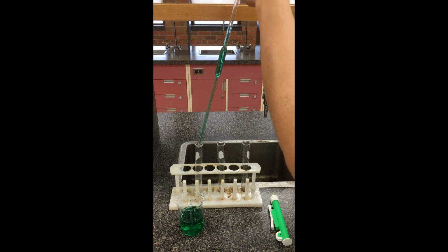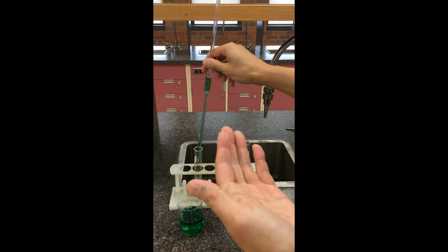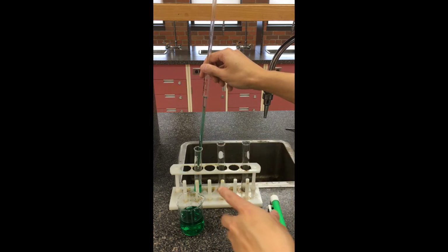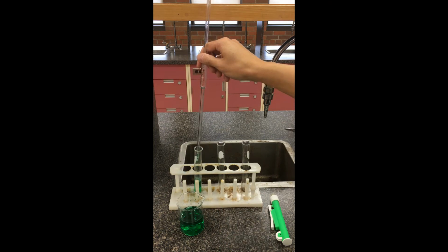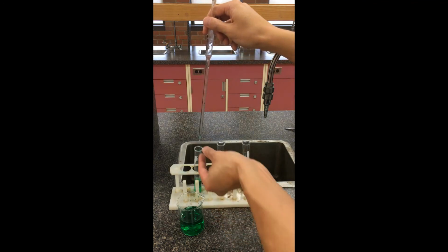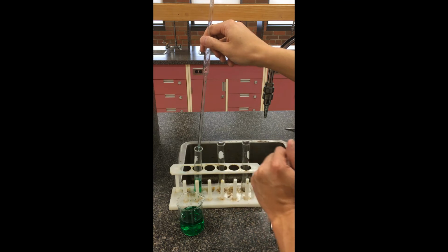I just have a test tube here, I'm just going to let go. So we've used the pipette first to soak up solution. I've calibrated it for exactly 10 milliliters, and I'm now pouring this into my test tube. These samples that I pull out of my stock solution can be called aliquots, that's the fancy name for it. You'll notice even towards the end, as the solution is dropping out, there is a little bit of solution left over. That's fine, that's been calibrated for. You don't need to force that solution out.